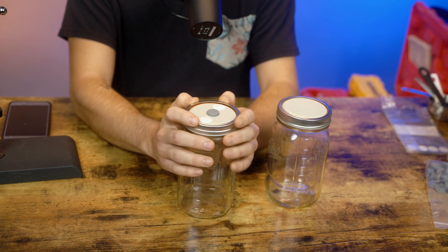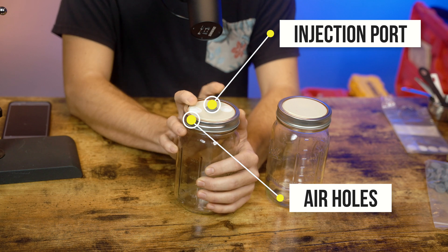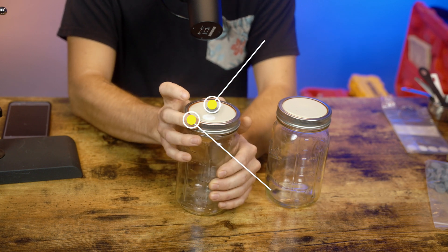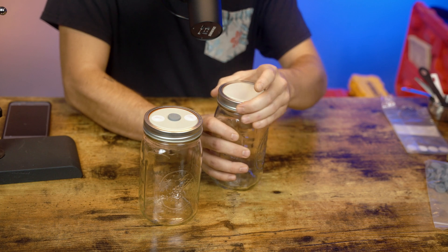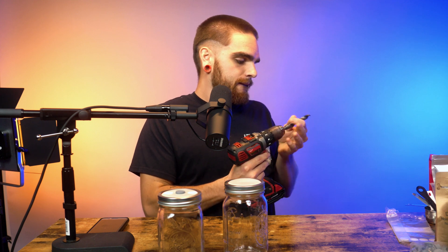First we're going to make our lids. For the lids we have an injection port and two air holes. I've noticed that two is a little bit better than one — condensation will build up on the sides and you can't really see what's going on inside your jar. Two or three is great; for these ones we're going to just do two.